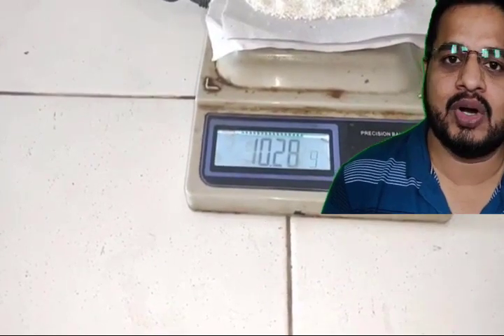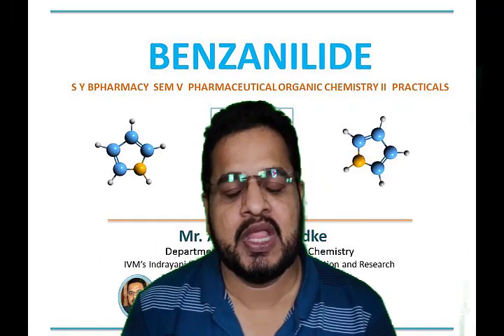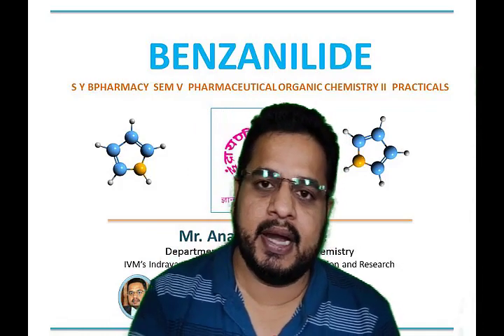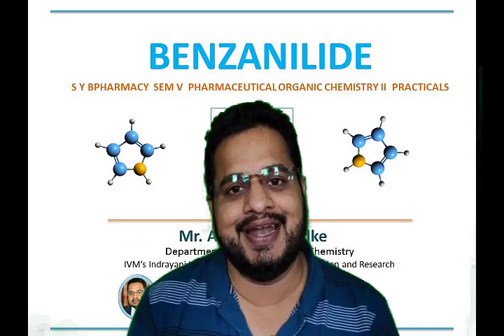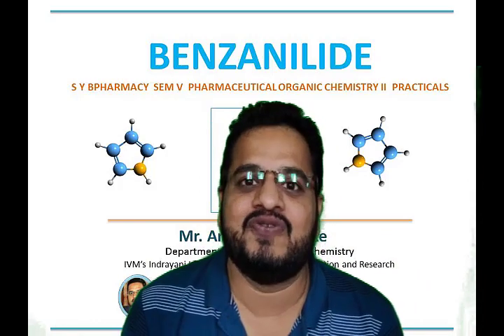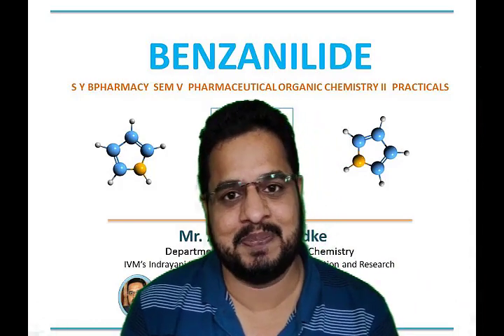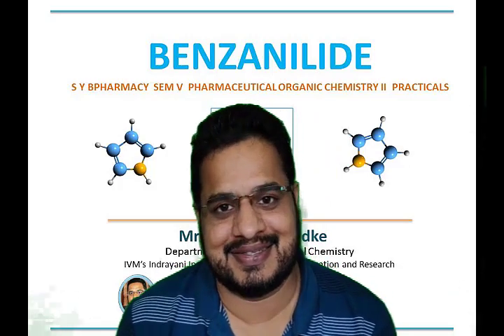Using the theoretical yield and the practical yield we will find the percentage yield. That is the practical yield divided by the theoretical yield, multiplied by 100. You will get the percentage yield of your synthesized compound. This is the way we have synthesized the benzanilide from aniline by the Schotten-Baumann reaction. In the next lecture, we will see some other synthesis. Thank you.